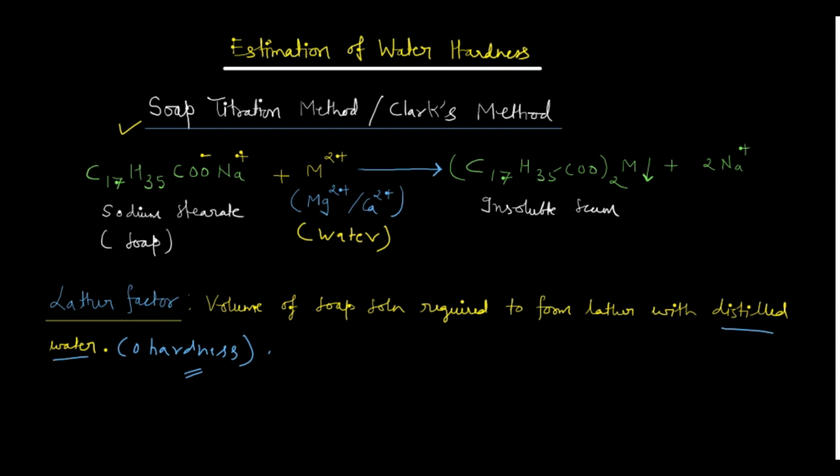It is considered that since the water is distilled, there should be no metal ions present in the water sample, but it does not happen actually, right? So this distilled water also consumes a little of the soap solution and forms this insoluble scum before forming the lather, right? So this is the lather factor which we need to subtract from any titre value you need. This is very important, right? So I hope this is clear.